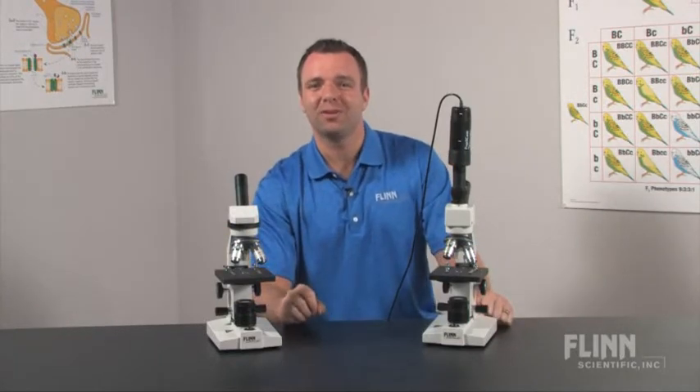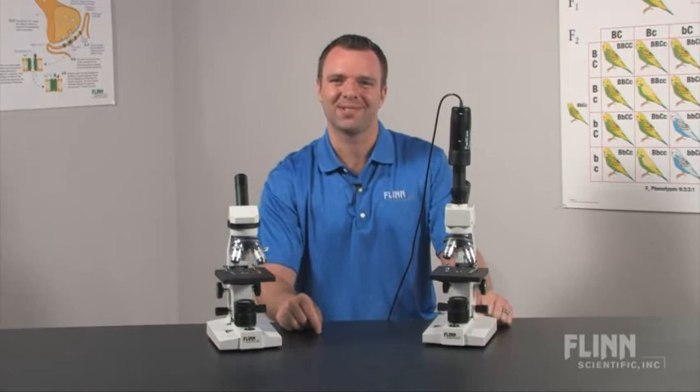The Flynn Economy High School Microscopes offer great, affordable choices for you and your students.